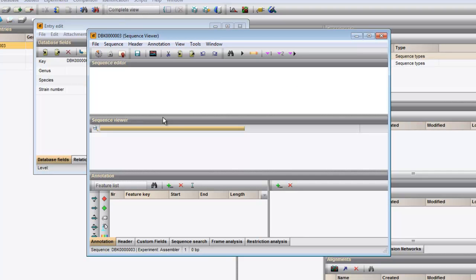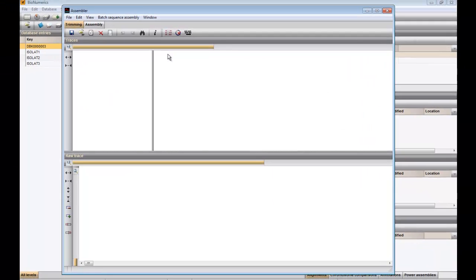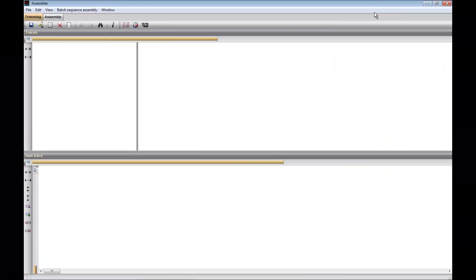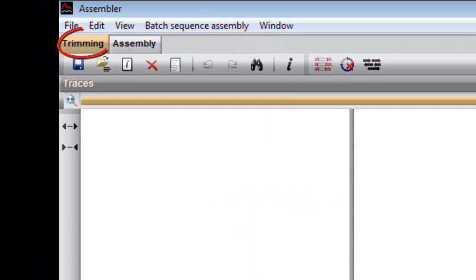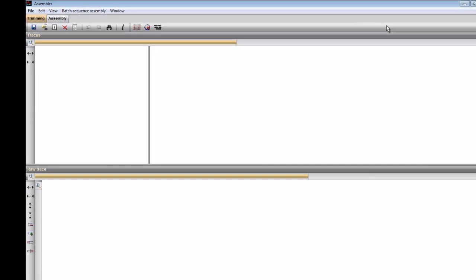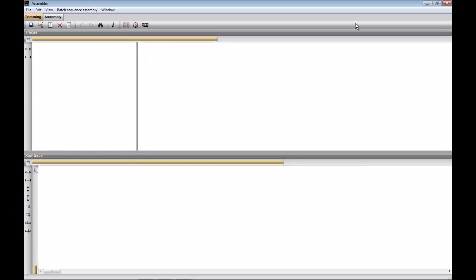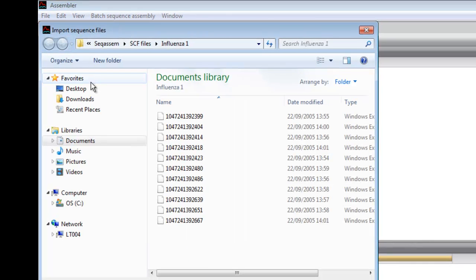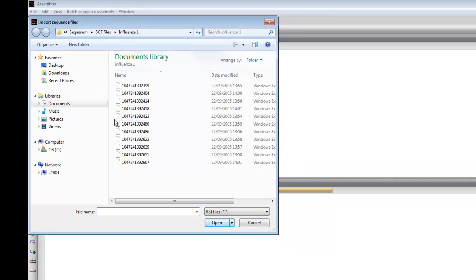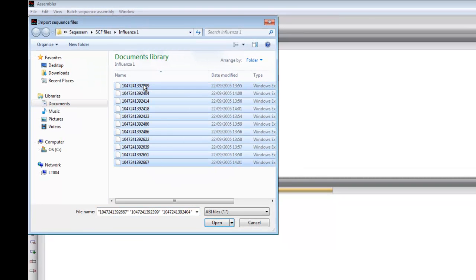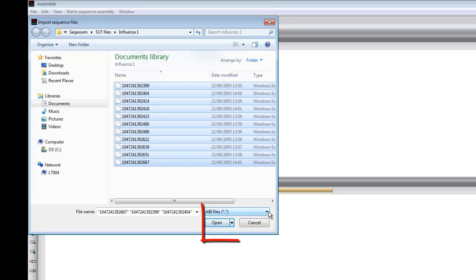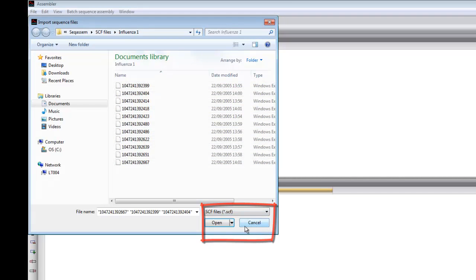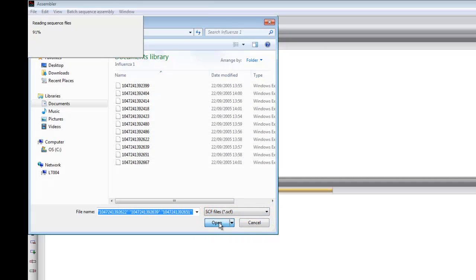We can start assembler by clicking on the Open assembler button. The assembler window consists of two tabs, the Trimming tab and the Assembly tab. We start in the Trimming tab, where we can press the second button to import raw chromatogram files from an automated sequencer. Select the sequences and adjust for the correct file format. Then click Open.